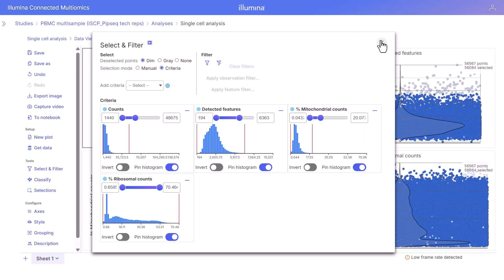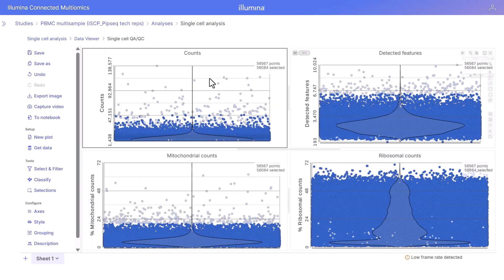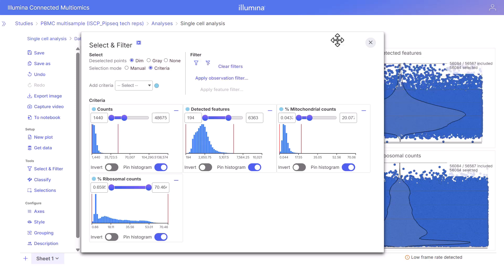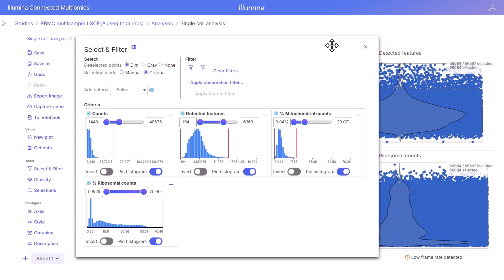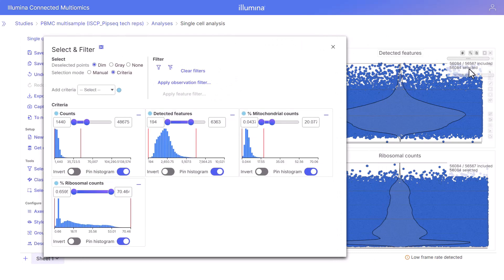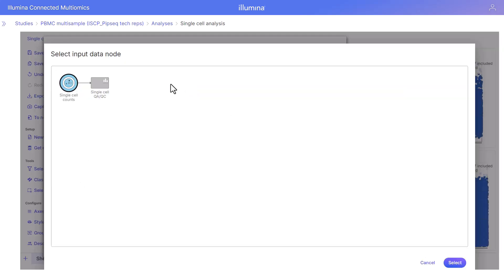We're aiming to remove cells that may be of poor quality — these could be cells that were damaged during isolation or cells with too few reads. A high percentage of mitochondrial counts could indicate damage and may need to be excluded depending on the context, because this is tissue and cell specific. When we make these selections, this is reflected in all of the plots in the data viewer, and we can filter to include these selected points.